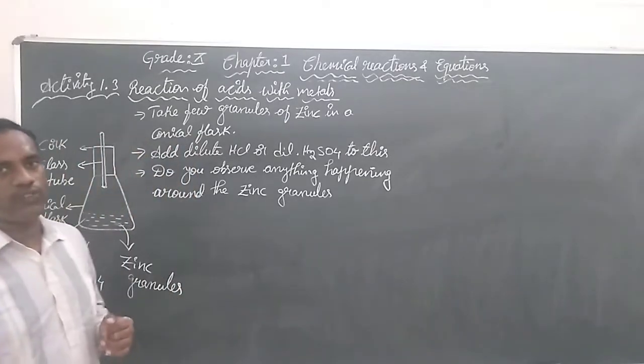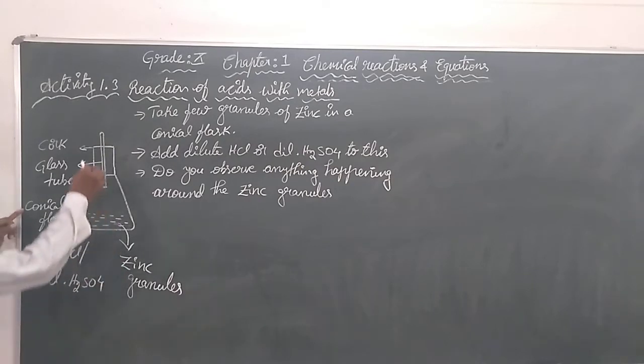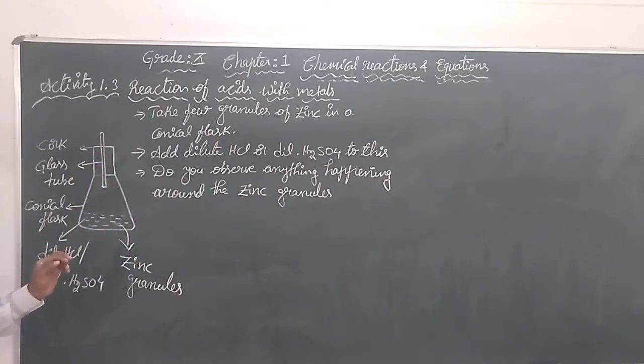The activity: we have taken one conical flask, our laboratory equipment. Into this, we add some dilute hydrochloric acid or dilute sulfuric acid.